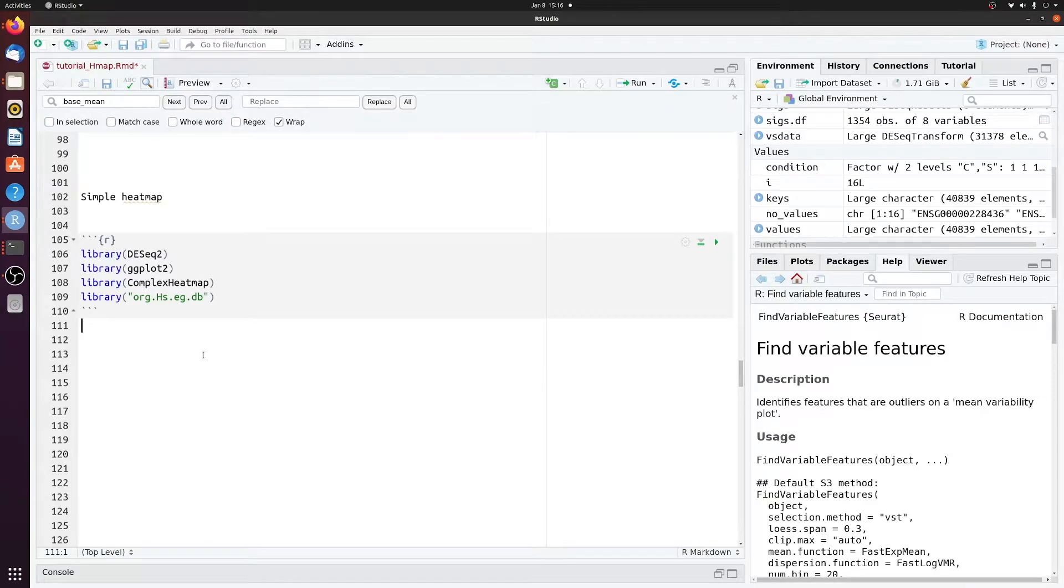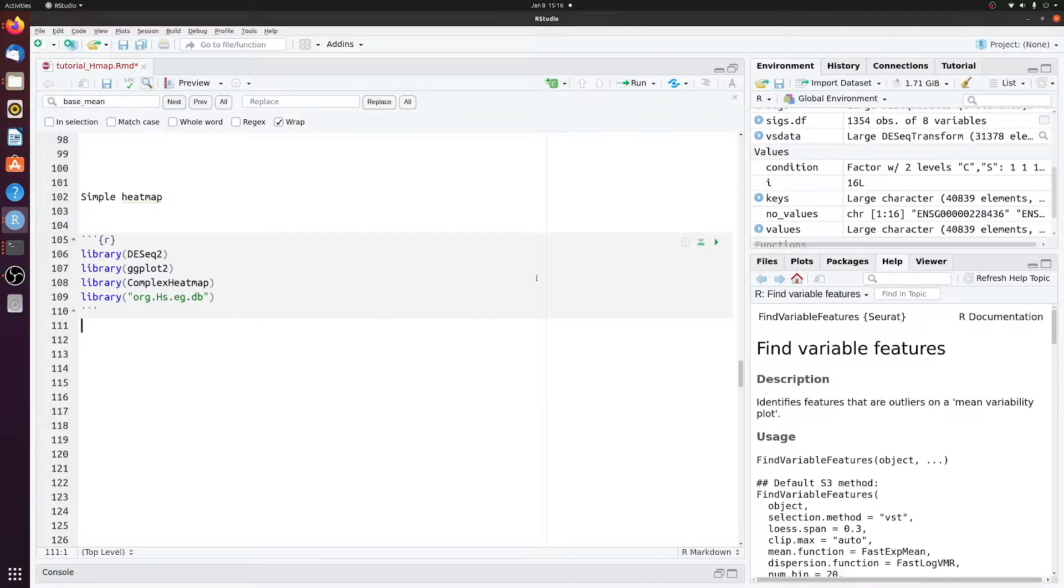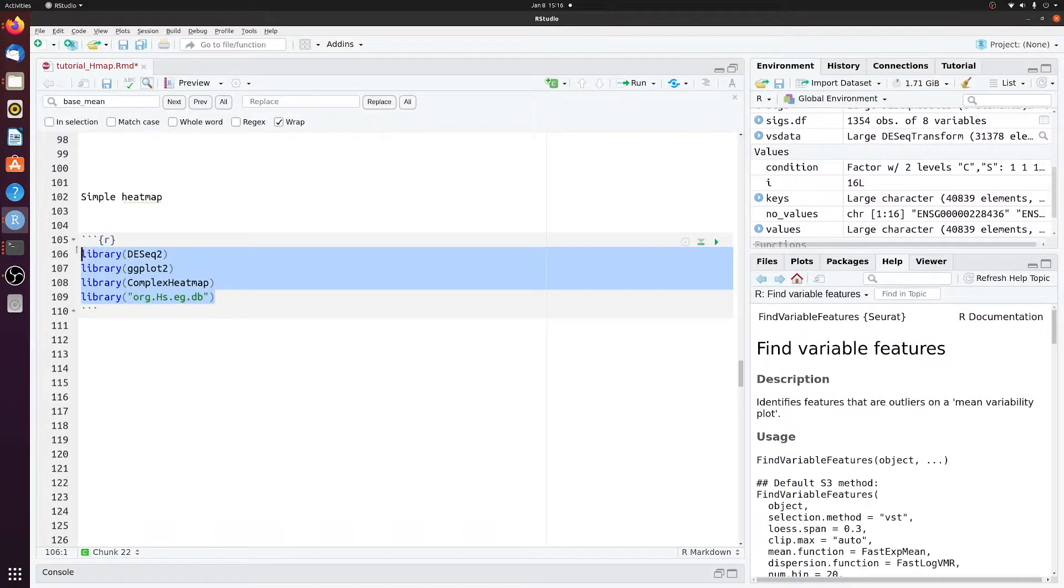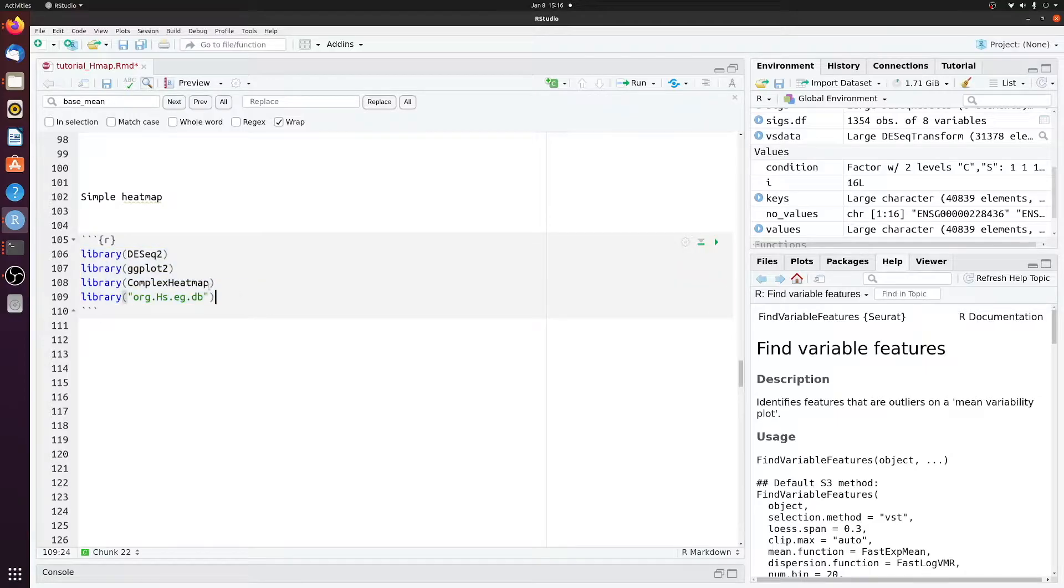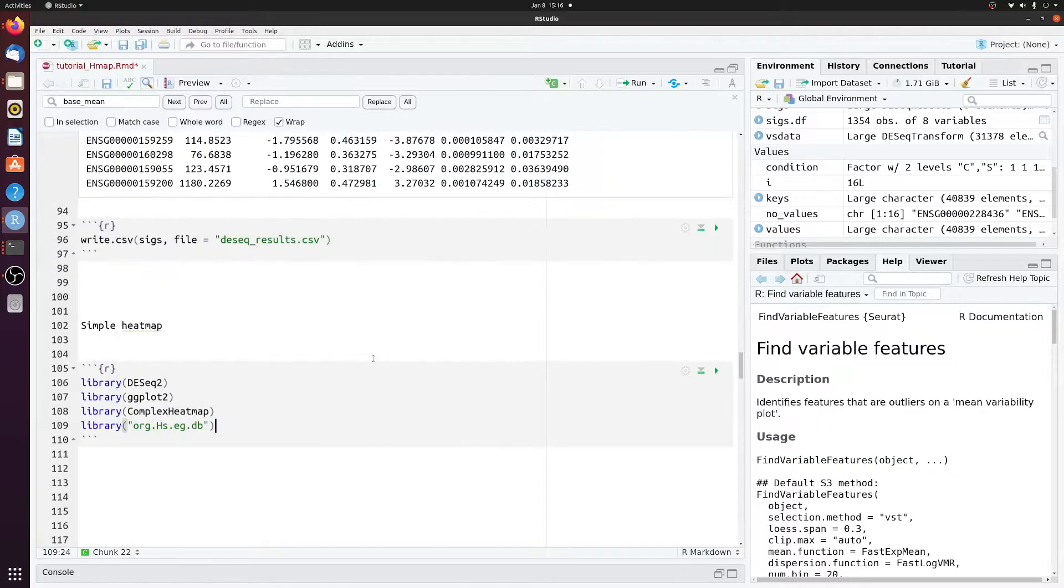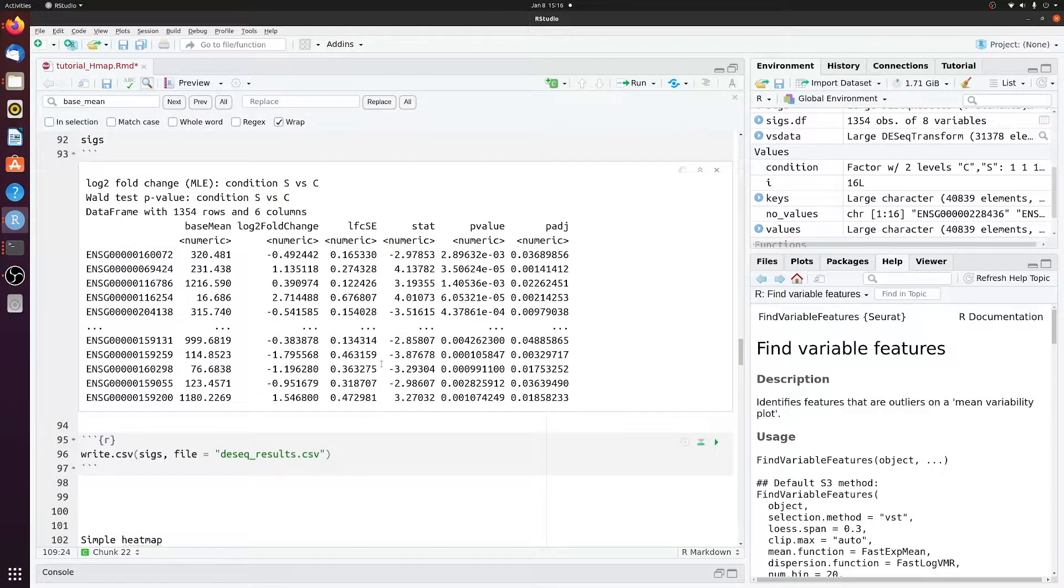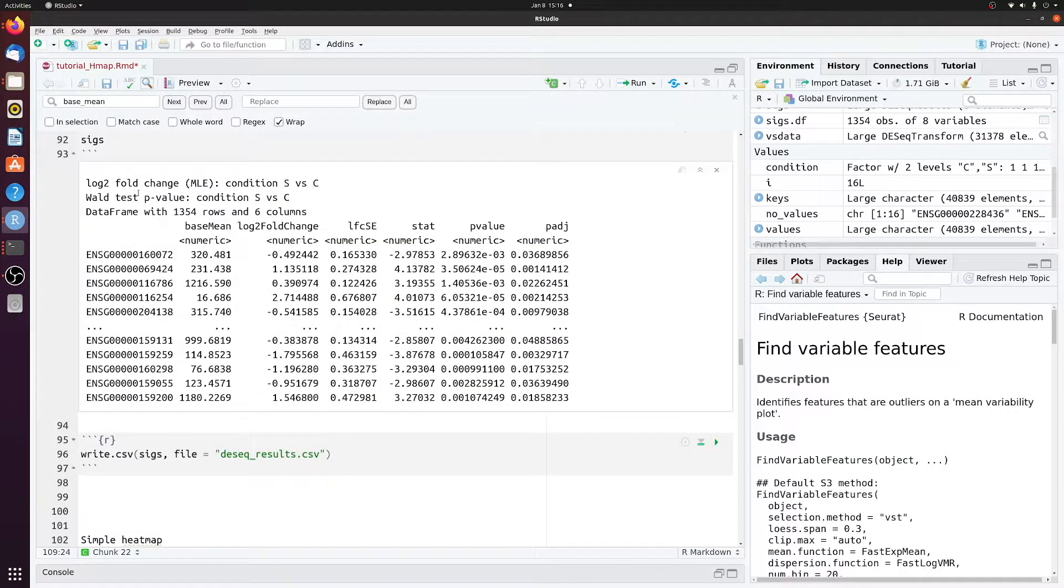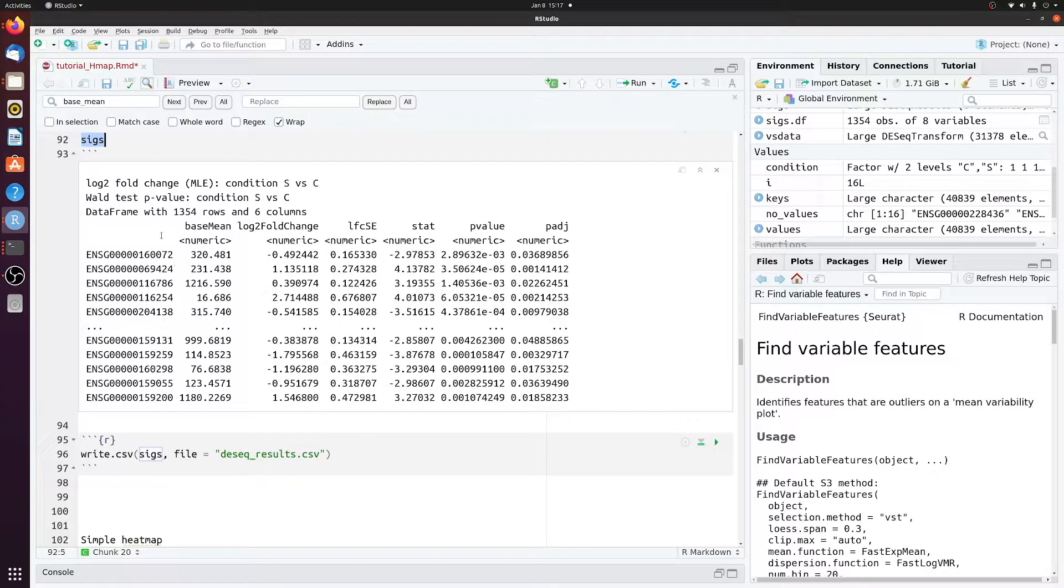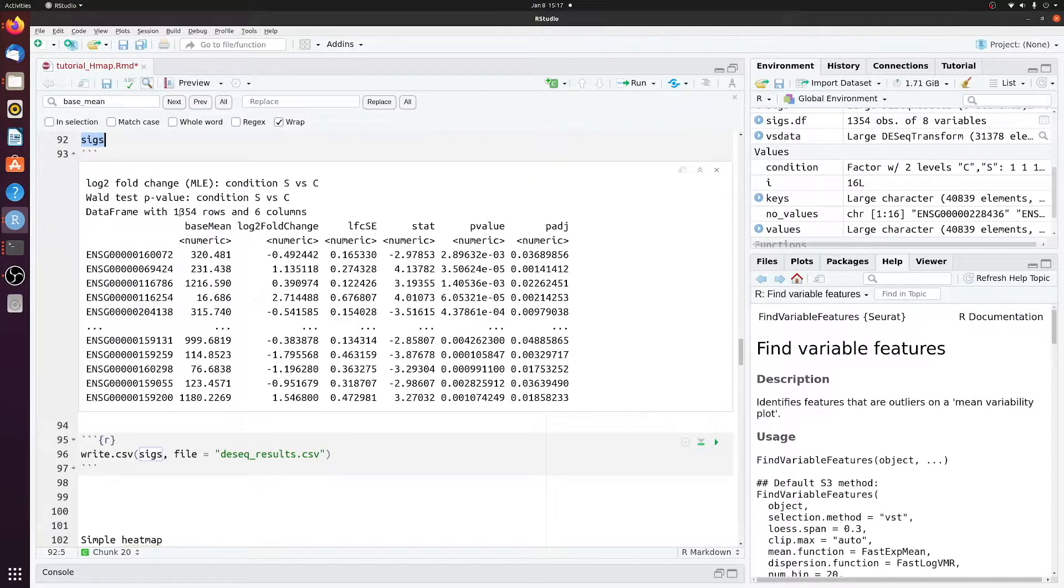All right, so I'm going to show you how to make a super simple heatmap instead of the more complex version I've shown in a previous video. These are the packages I have currently loaded. I'm just starting off where we left off at the end of the dseq tutorial with this table of differentially expressed genes. We have 1300.